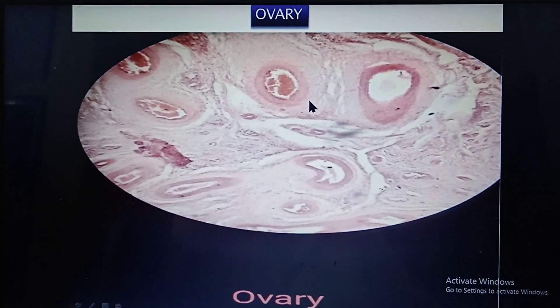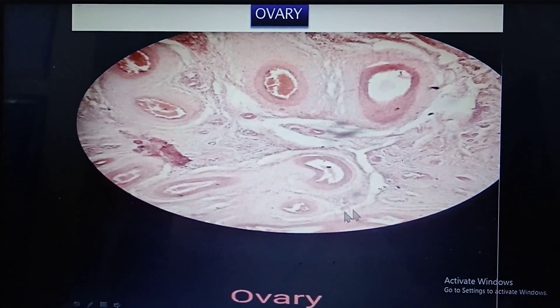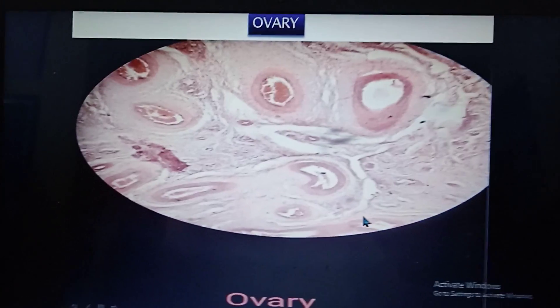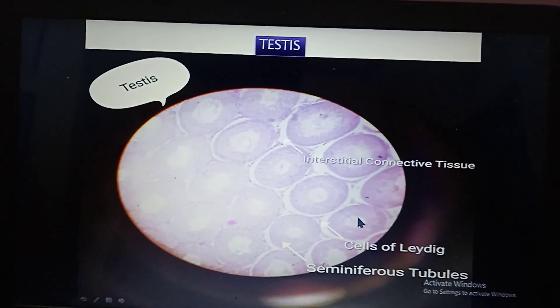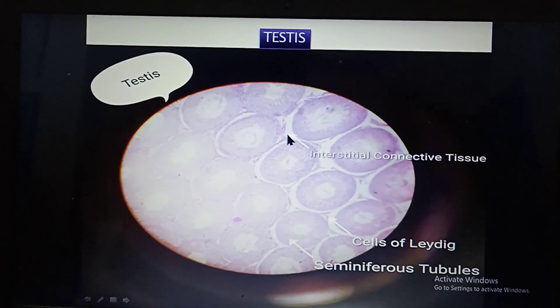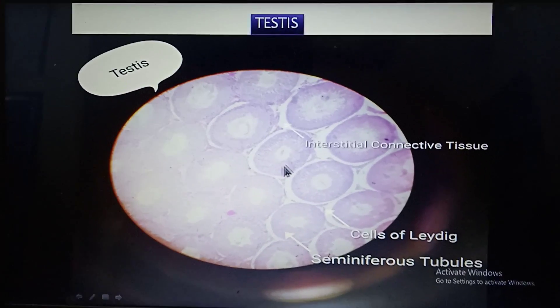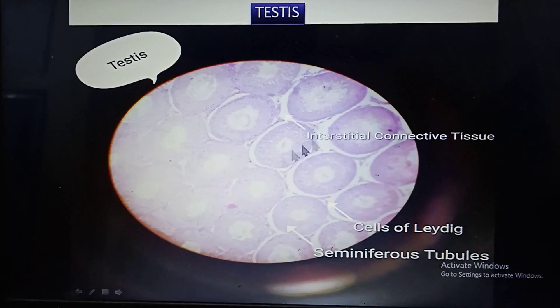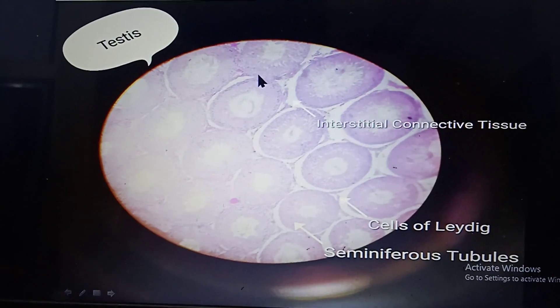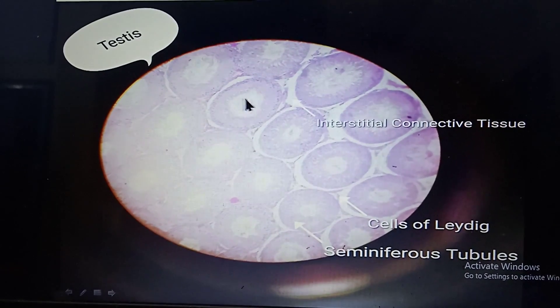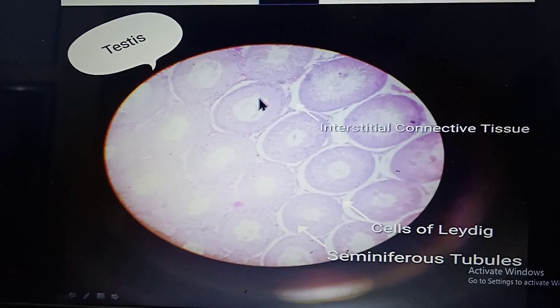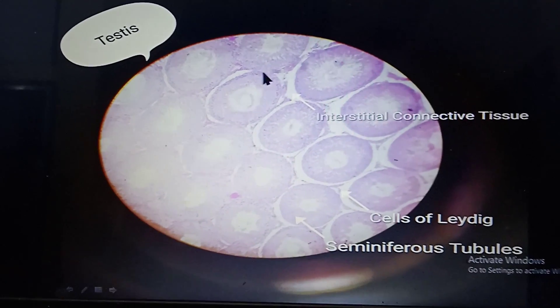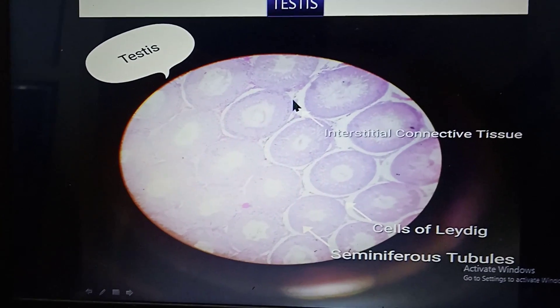This is the ovary, which is very much characteristic — ovarian follicles are present all around. This is the testis, very similar to epididymis, but here the cross-sections are round. The mature cells are smaller in size and are towards the lumen, whereas towards the periphery there are immature cells which are large in size.